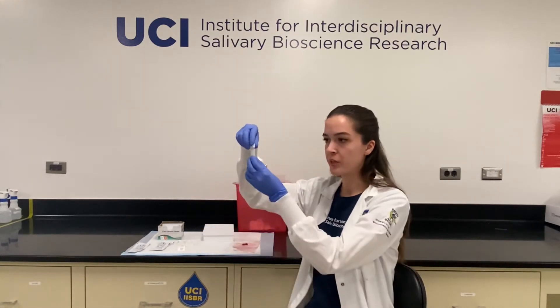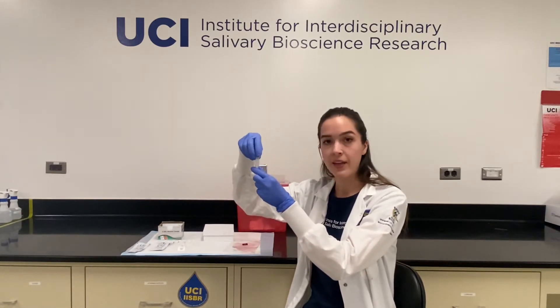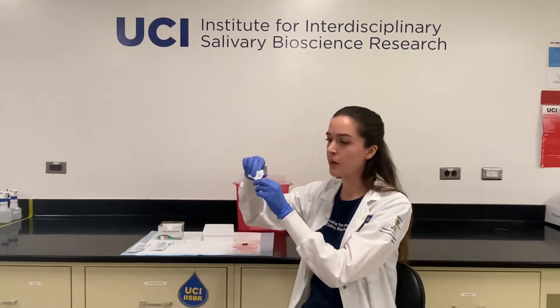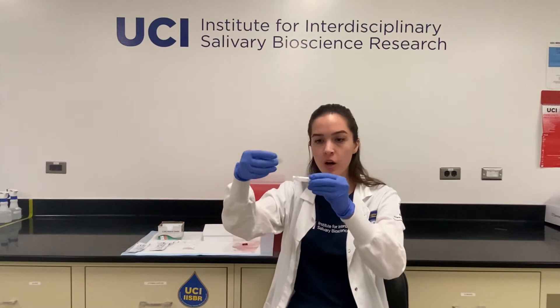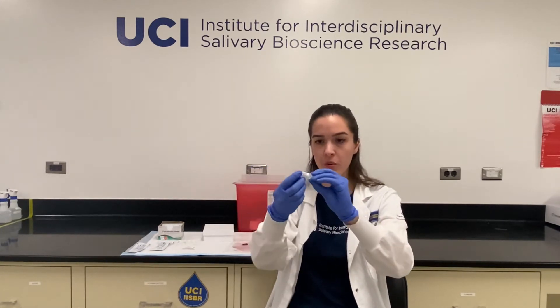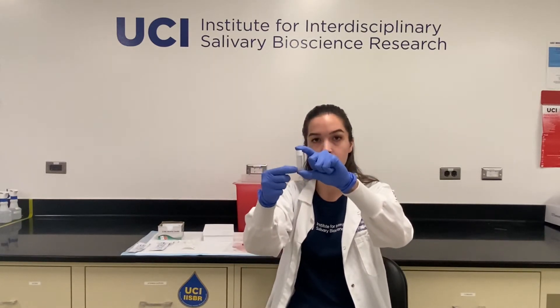Once you're ready to collect your sample, you want to make sure to select the right tube to collect into. If they've been barcoded, that will help you make your selection. If they haven't been barcoded, you've probably been given barcoded labels. You'll select the correct label and place it over your tube onto the white patch, being sure that the barcode is running lengthwise on the tube and that it's not covering over the volume markers on the other side of the tube.